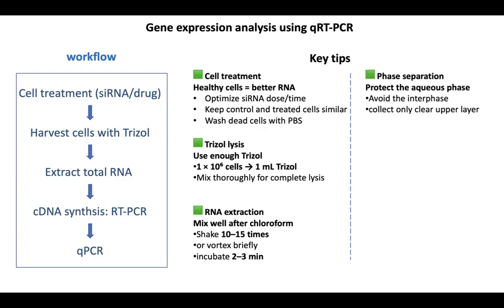At phase separation after centrifuging, carefully collect only the clear upper aqueous layer. Avoid touching the interphase, which may carry DNA and protein contaminants.